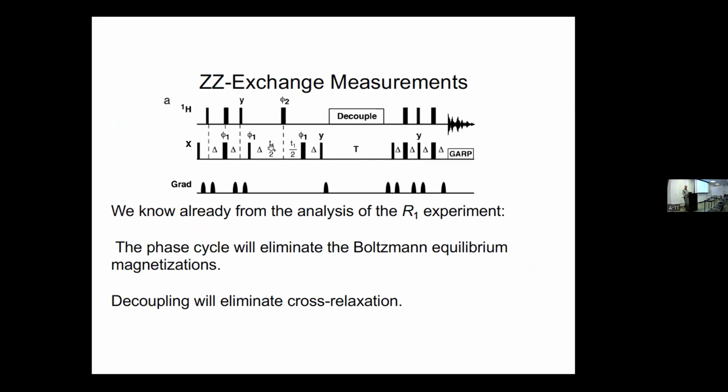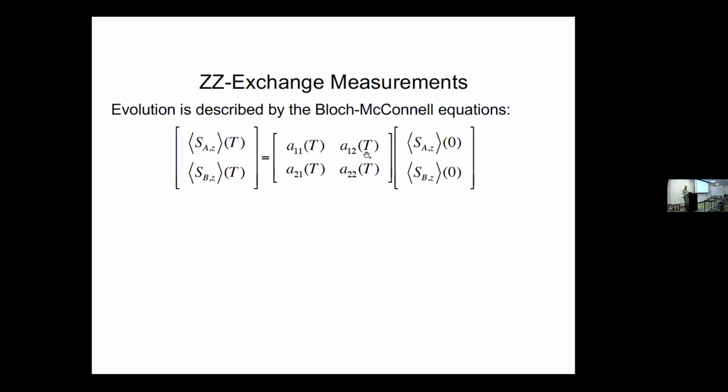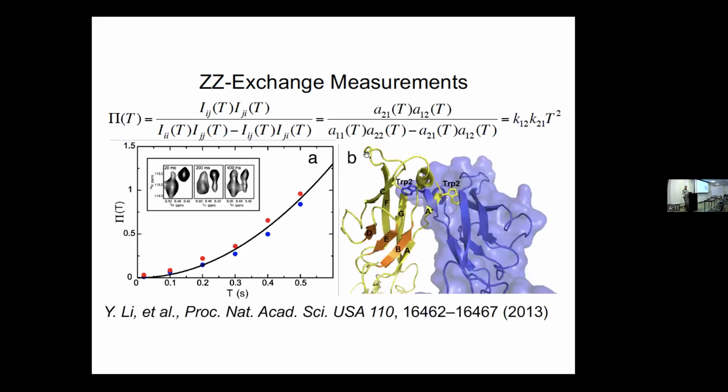So that by the time you get done with transfer, you've altered the peak intensities relative to Boltzmann equilibrium. But John Markley has a modified HSQC where you collect a series of spectra and can back predict then the exact equilibrium constant. And then you can separate these. That's all described in Yu Li's paper.